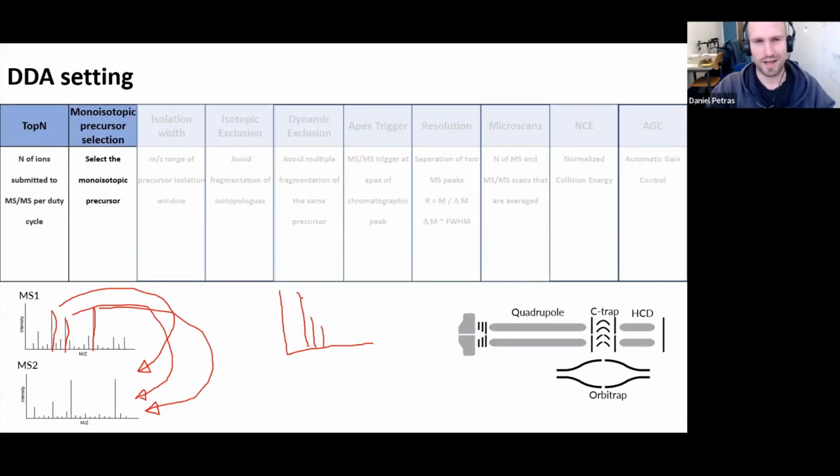But if we have, for example, halogenated compounds or especially higher mass peptides, then often the most abundant peak is not the monoisotopic peak anymore, but rather the plus 13C isotope peak. So here it can be important that we actually pick the monoisotopic peak, particularly for peptide analysis. There's simply a setting that tries to pick this first one and not simply the most abundant one.